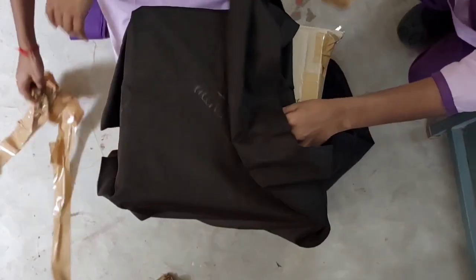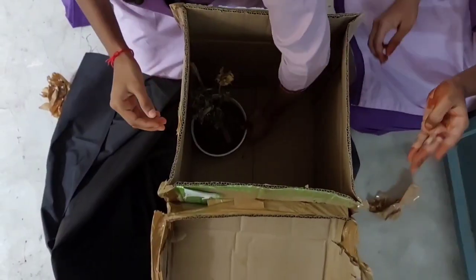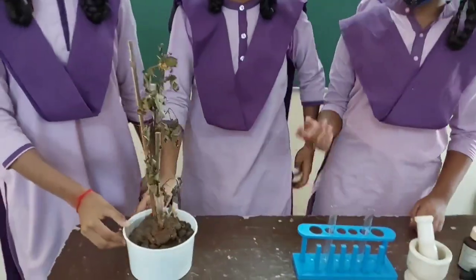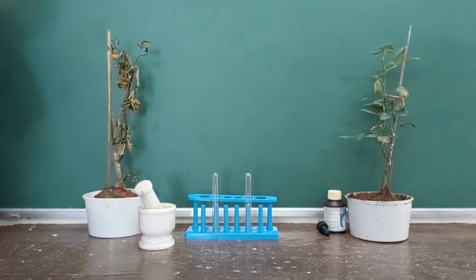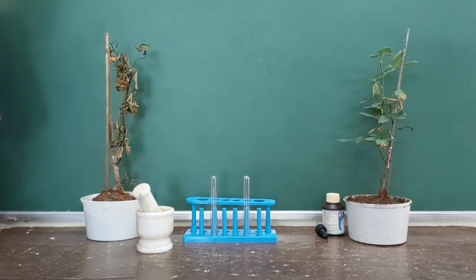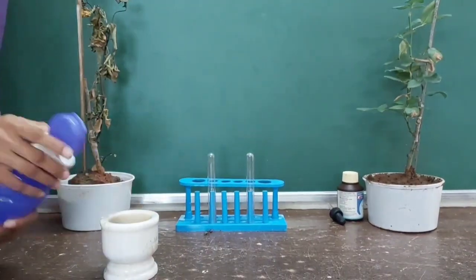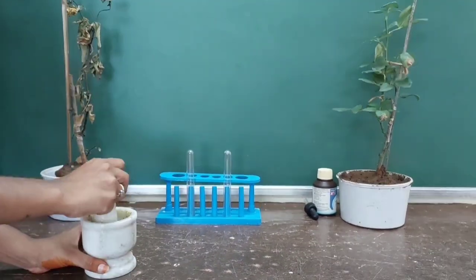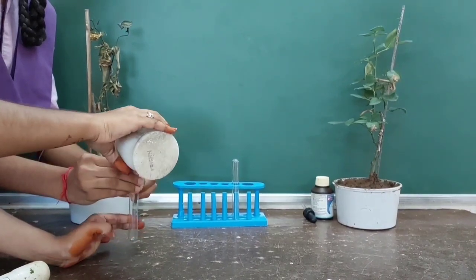I think you understand this. After one week, we will take out the plant from the dark. Children, observe this plant — see how it has withered. Compare this plant with the plant kept in sunlight and we can see the difference. Now take some leaves from the plant kept in dark, add a few drops of water, and mash them to make a paste to get the extract. Collect this leaf extract into a test tube.